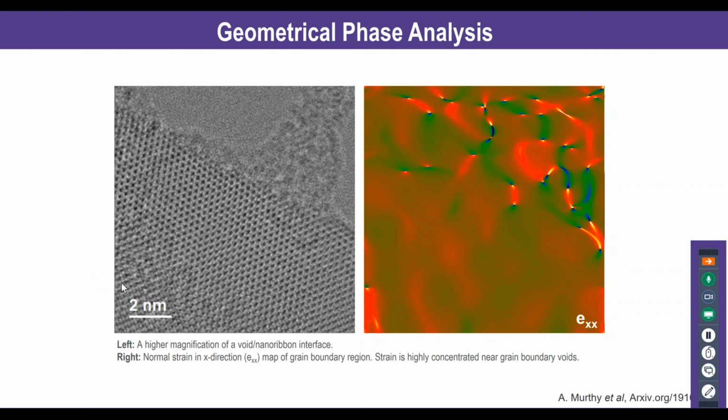So this is just to give you an idea of the potential that you have for this type of experiment, right? This is a combination of in situ and direct imaging. So you can think about applying heating, or applying external light to some photosensitive materials, for example. You can apply it and see degradation. There are a lot of improvements now in in situ holders, like liquid cells, gas cells, and so on. This is a very good combination of different things that you can do in the microscope these days.